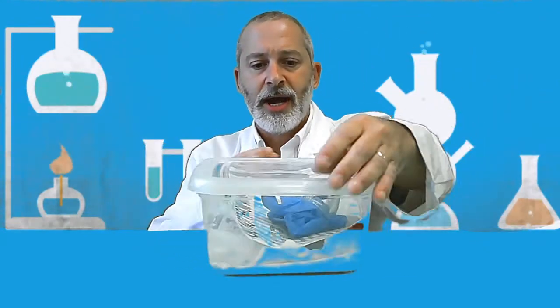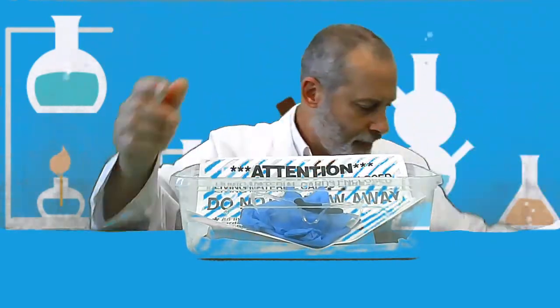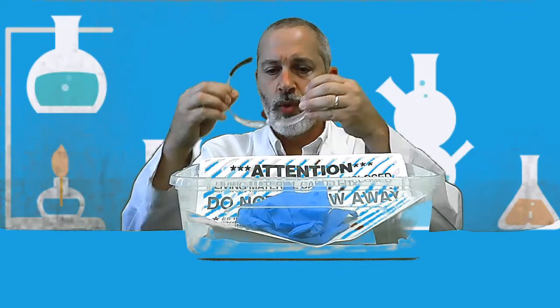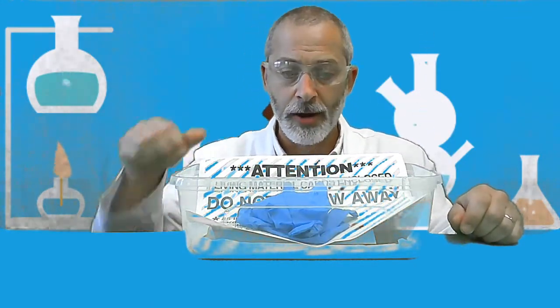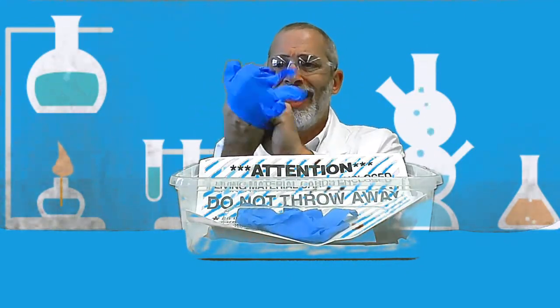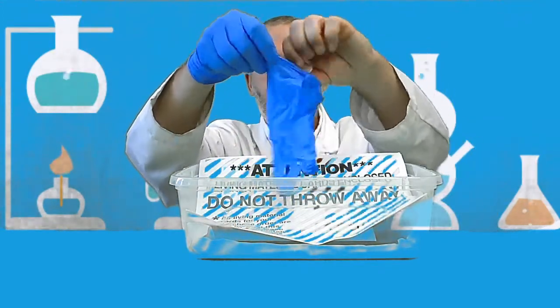And inside this container are a set of goggles we have to wear first, because safety is the number one priority. And we want to protect ourselves from any alien creatures. So I am going to be wearing gloves here.